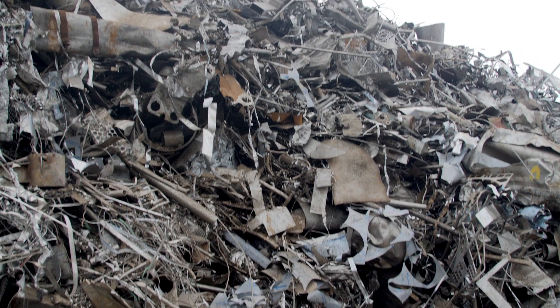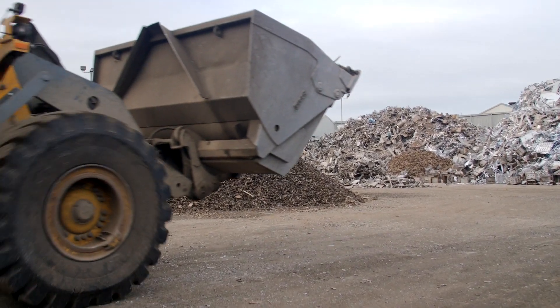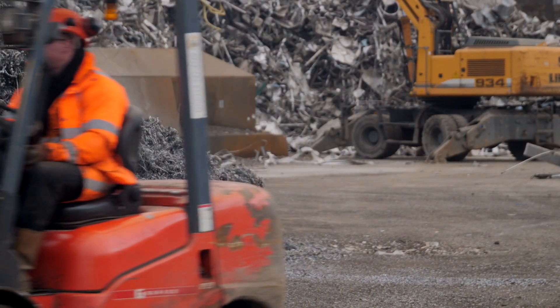We process and turn over thousands of tons. We have to meet the very highest of standards. All of the material that we supply into the stainless steel works requires extensive testing.